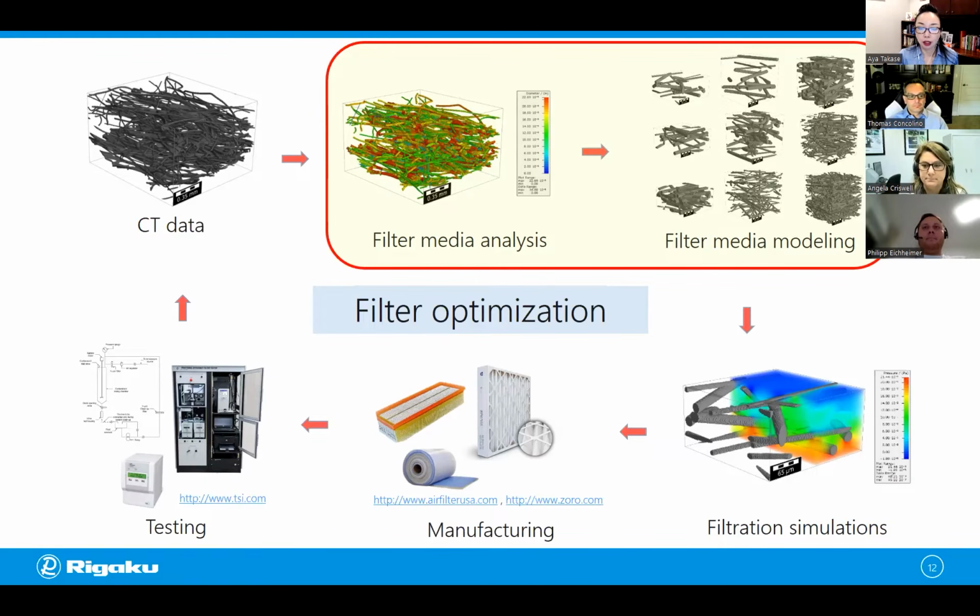Okay, so let me launch the first question. The question is, which tools are useful for improving segment results? You have 4 choices, and you can choose as many as you want. The choices are image filtering, artificial intelligence, Otsu binarization, and morphological operations.